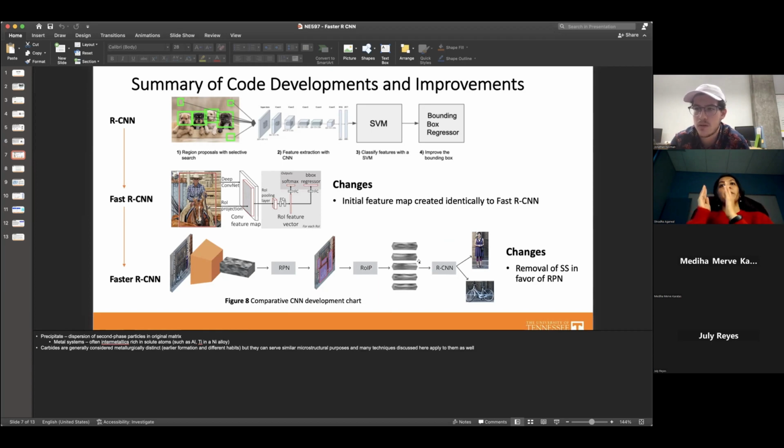Right. And then RPN. This is the only term that's not clear, so what is RPN doing here? RPN is a pyramid network, right? It's a pooling network. What was the first thing you said? It's an RPN pyramid. That's a good question. I believe it's a pooling network. RPN and ROIP, that is region of interest pooling.